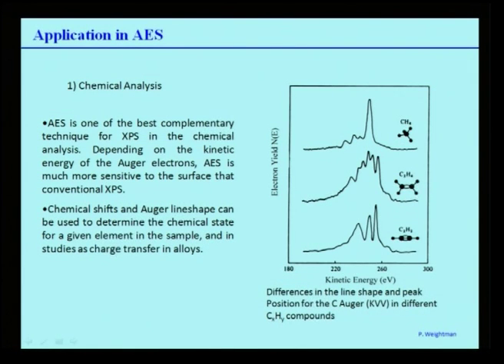Well, now let us move into the applications. As I said, we are going to discuss that today. The analysis depth was just information I wanted to convey clearly. We have already discussed chemical analysis by using XPS or X-ray photoelectron spectroscopy. AES is one of the best complementary techniques for XPS in chemical analysis. Depending on the kinetic energy of the Auger electrons, AES is more sensitive to the surface than XPS.